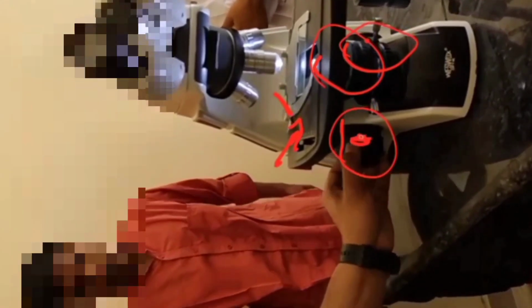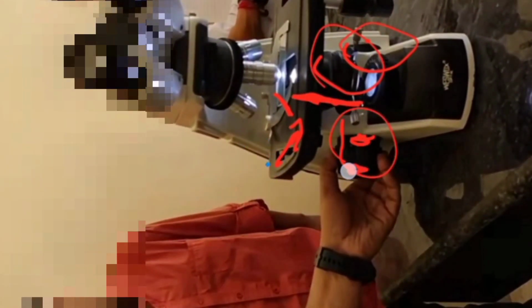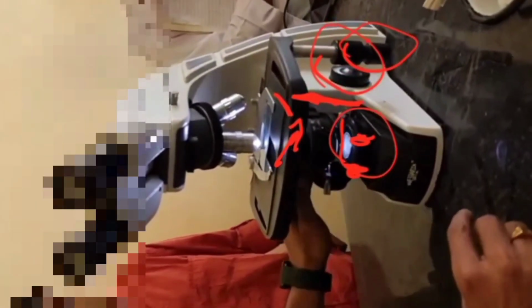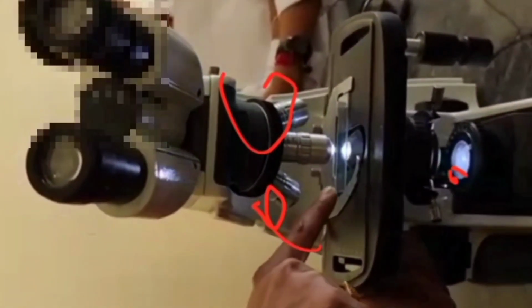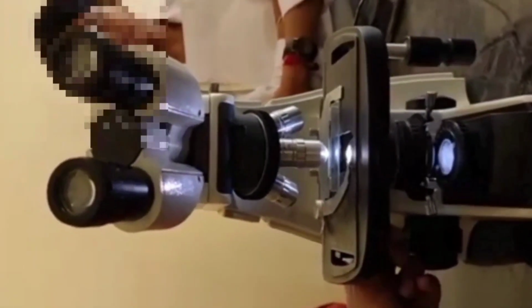So the inner one is the coarse adjustment, to move up and down, and the side one is the fine adjustment, slight movement to focus it better. And this is to increase the height of the stage and sub-stage. So this is the sub-stage, the condenser and diaphragm are there, so we can use them for that.